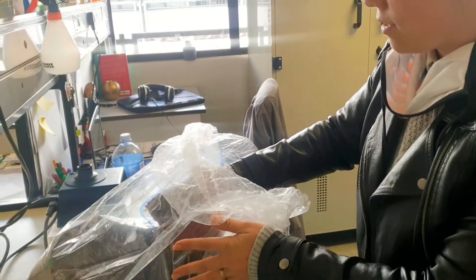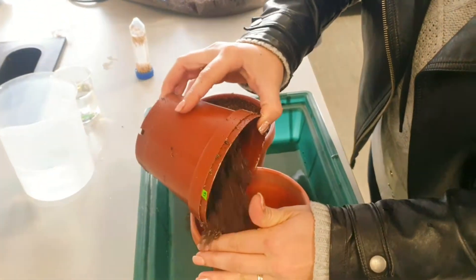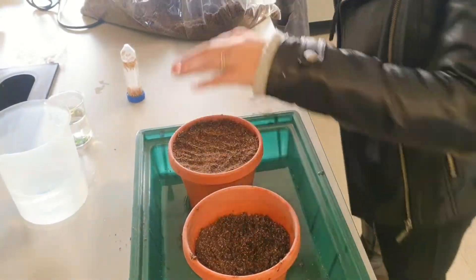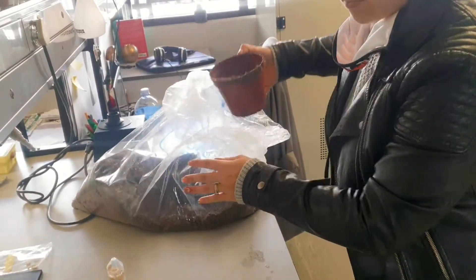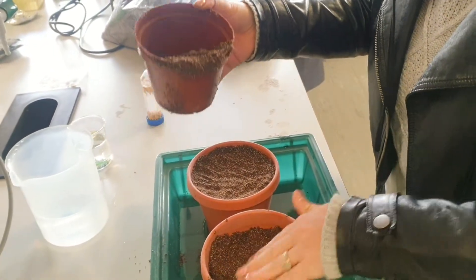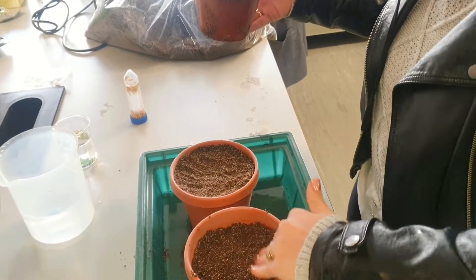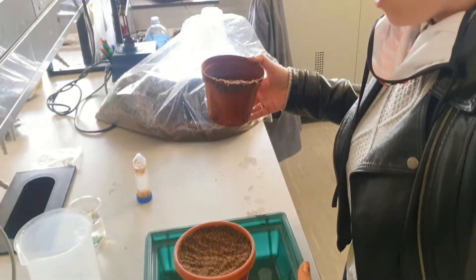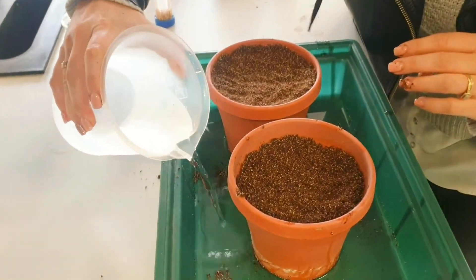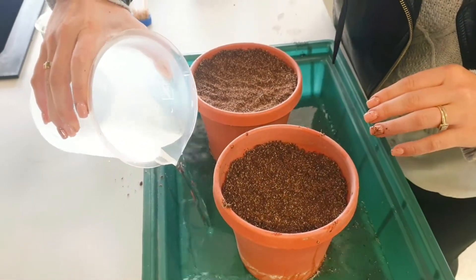I first start by adding some soil to the pot — I've already done one pot, so I'll do this one now. I leave about one to two centimeters from the top, and then I add some water so that the soil can start soaking up the water.